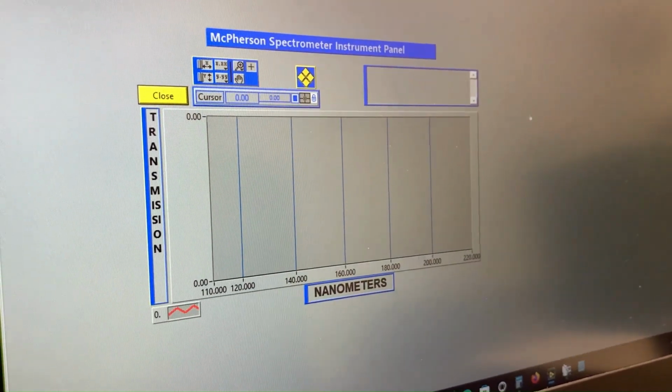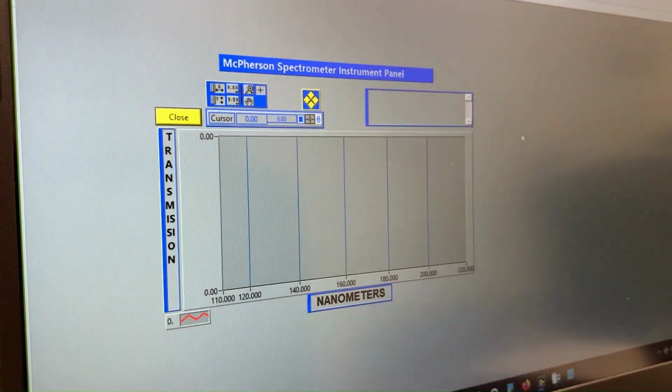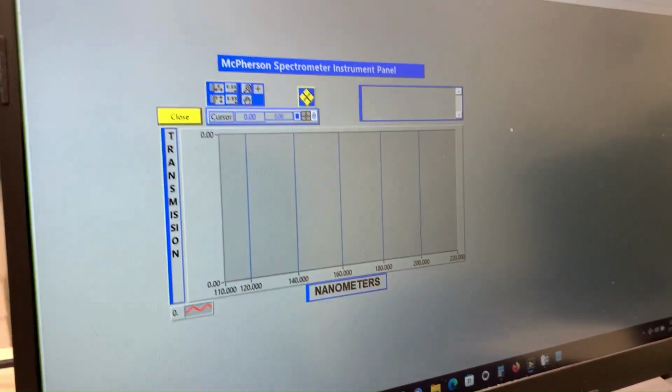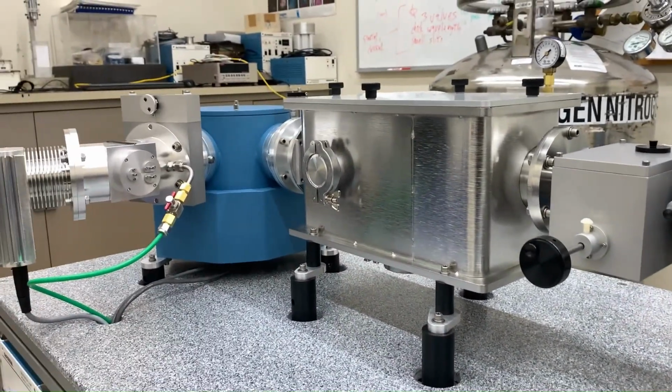At this point in the operation, it's important not to hit cancel or close. You might realize, oh, I forgot to set something up, and want to cancel this, but when it's slewing to its start position is a dangerous time. The instrument will lose its calibration. It will lose its reference to its current position, basically, and you'd have to re-zero or recalibrate.